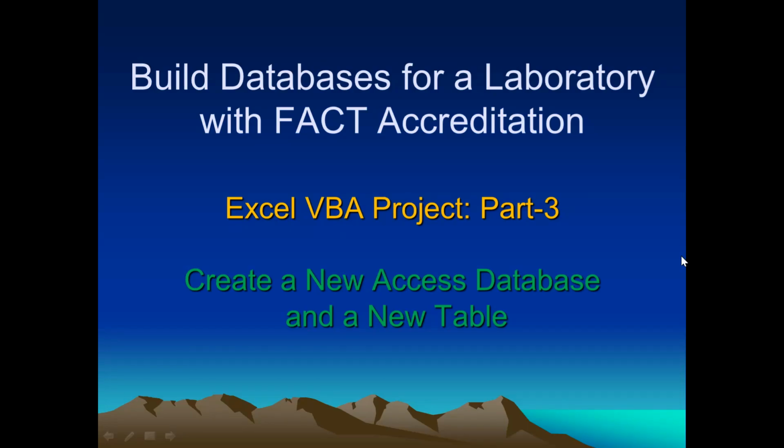Hi. In part 2, we create a new Excel file with the VBA enabled. So it's for patient information entry. So the next step is we need a database to hold the data. So I will start from the easiest database, Access database, for this learning project. Later, I may set up another SQL database to add more work there.